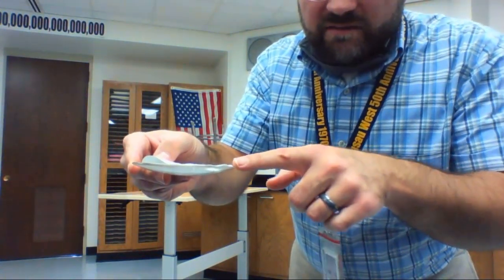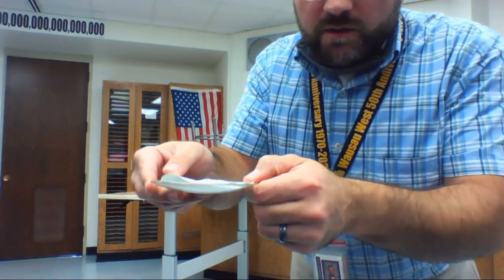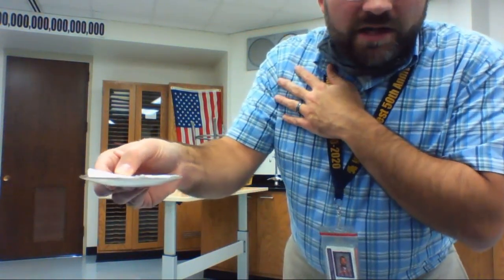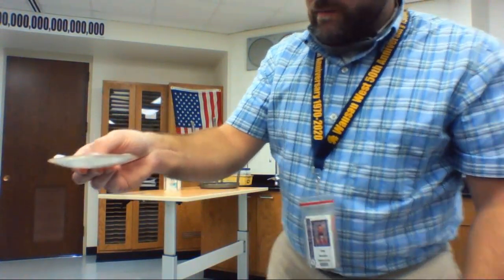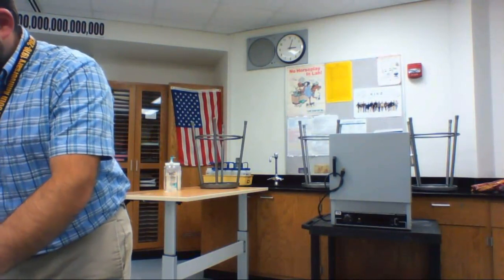Previously, I had taken the mass of my paper. I had also taken the mass of my watch glass. So all I need to do is put this whole thing on there so that I don't lose any of my sample. Because again, it's a powder, right? If I breathe on this or sneeze on this, it's going to go flying everywhere. So it's nice to use the watch glass because it's nice and stable as opposed to just the piece of paper. So let me put this on the balance. I'll turn my camera and show you what I'm up to.